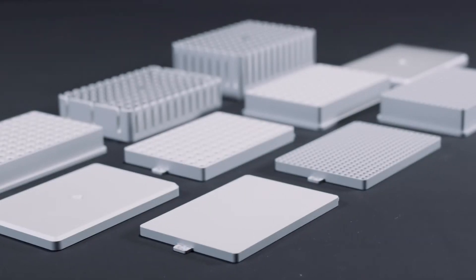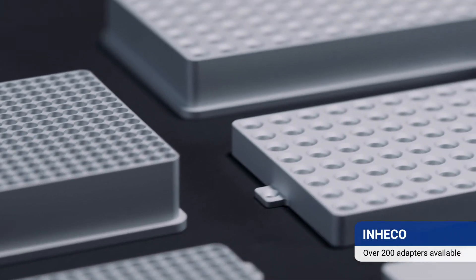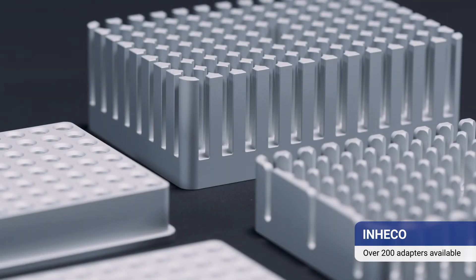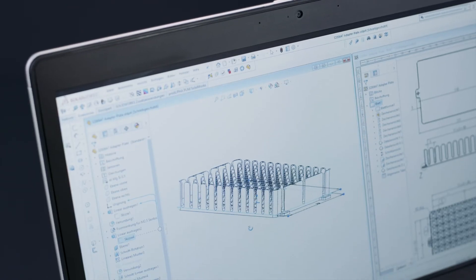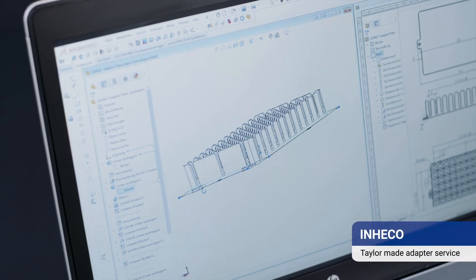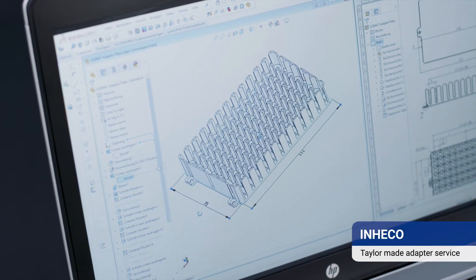We offer over 200 adapters — more than twice as many as our closest competitors — produced in-house to ensure a perfect fit to the geometry of the disposable. If an adapter is not available for your required disposable, INHECO provides tailor-made adapter services to deliver a complete solution.